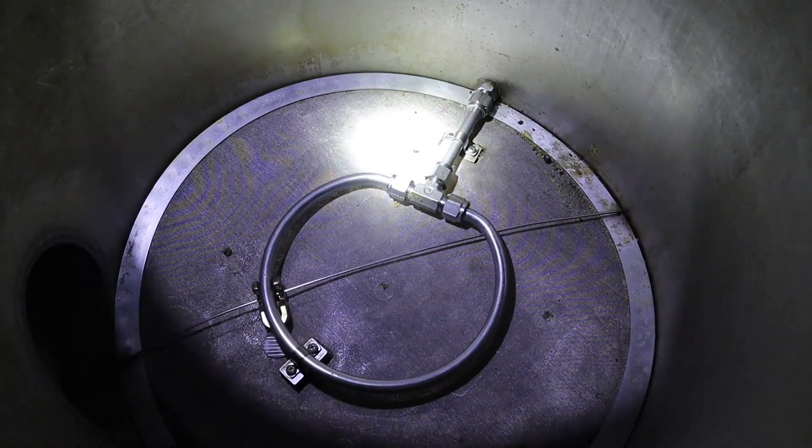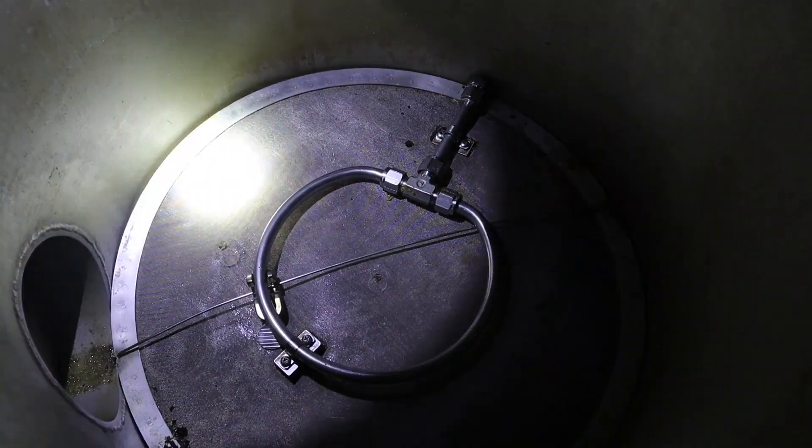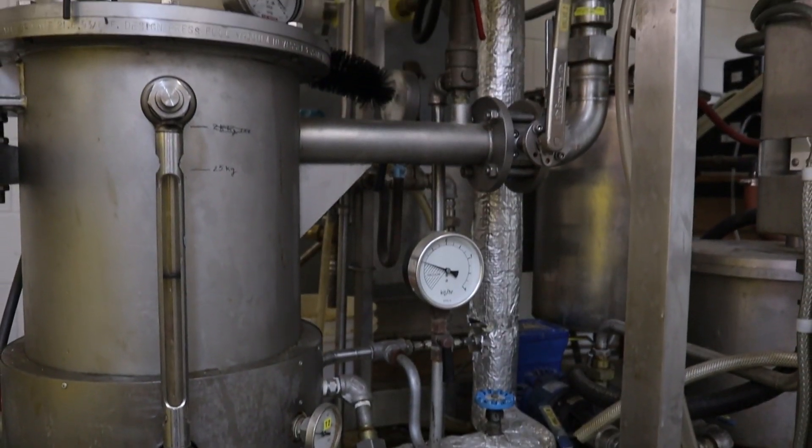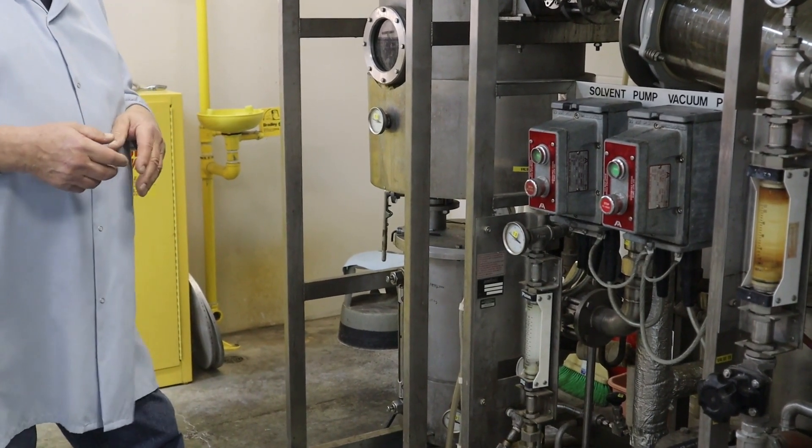And there's also another ring like that in the bottom that during the extraction process we turn on nitrogen for just a little bit of agitation to help speed up the oil extraction from the yellow flakes.